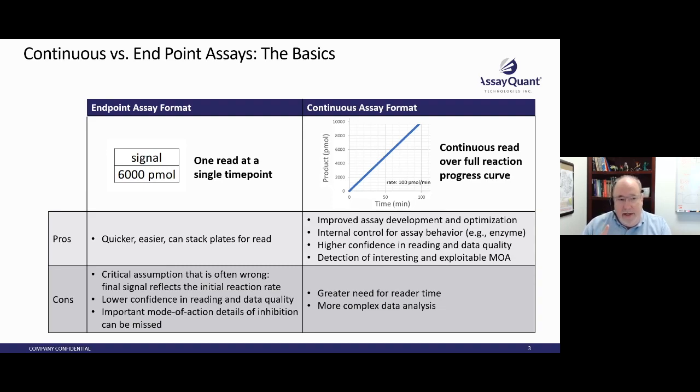All right. But that point is simply the signal at that time point. And the assumption is that it's linear from the zero out to that time point. And so therefore that point is actually reflective of the initial rate of the reaction.